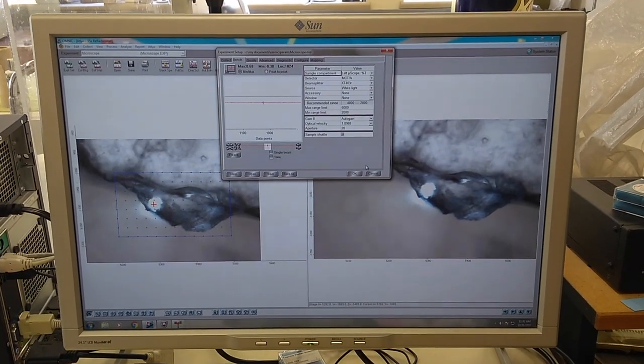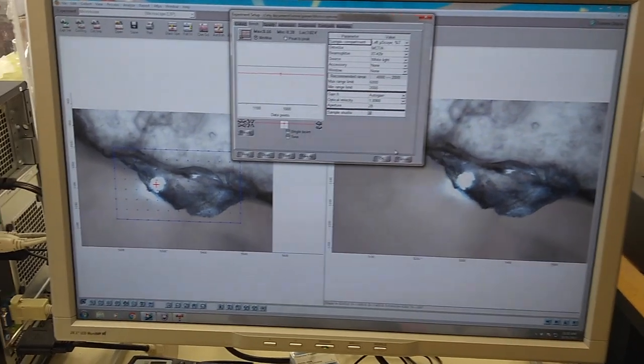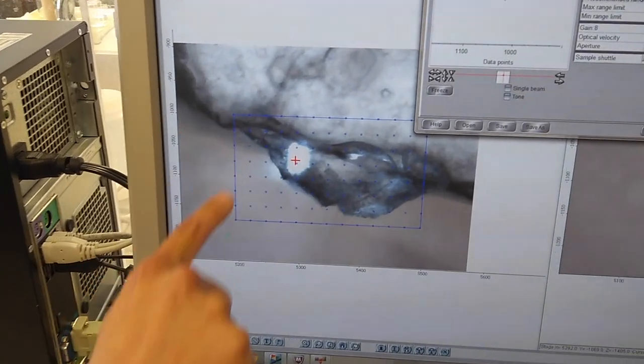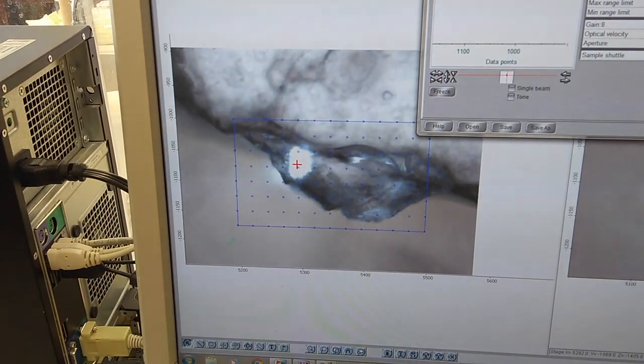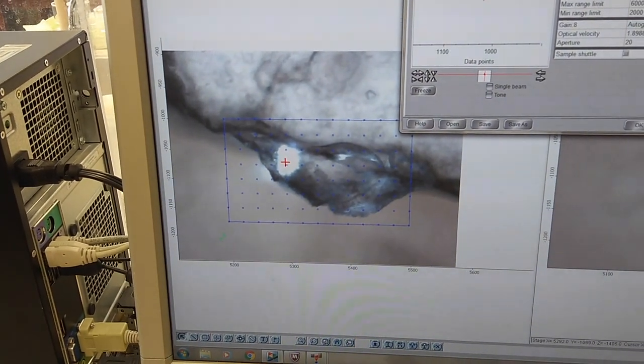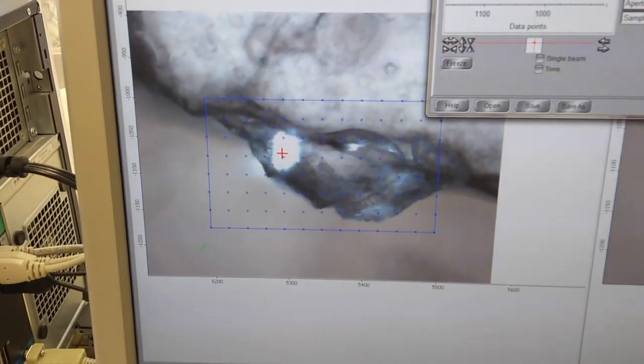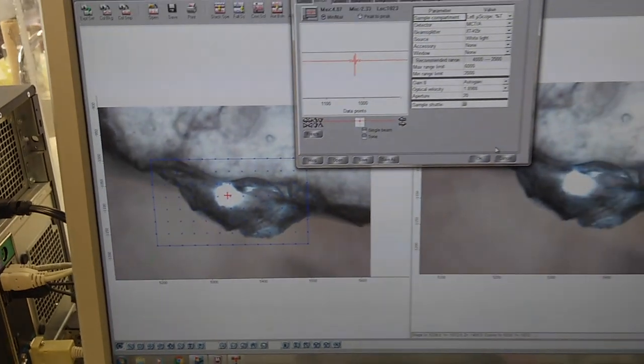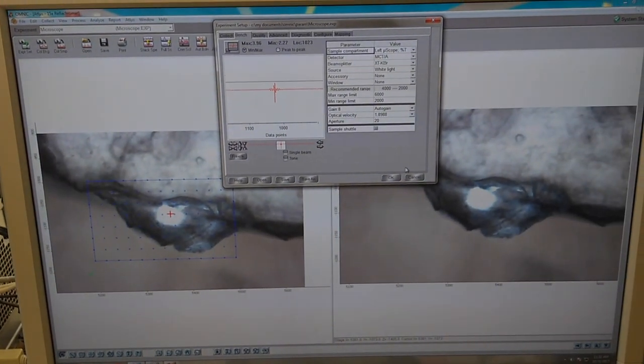We're making a map of the amount of water and CO2 dissolved in the glass. You can see the size of the box of the map that we're making drawn here. Each point within the box is one position in which we'll take a measurement. When we compile all these together, we'll be able to make a single map of water and CO2 concentrations.